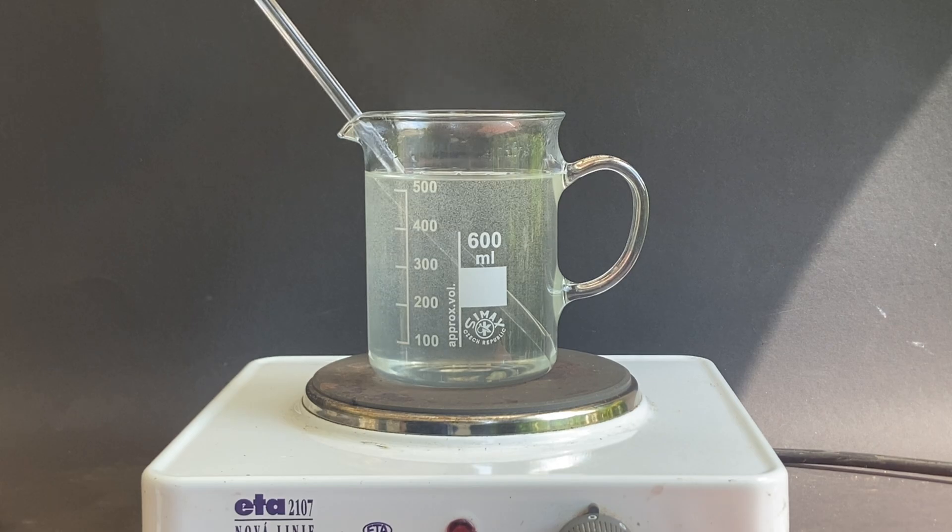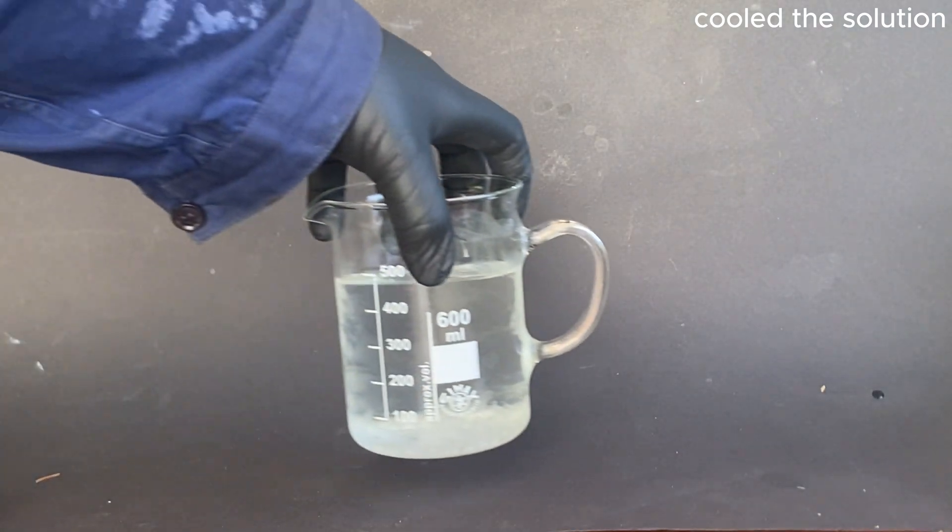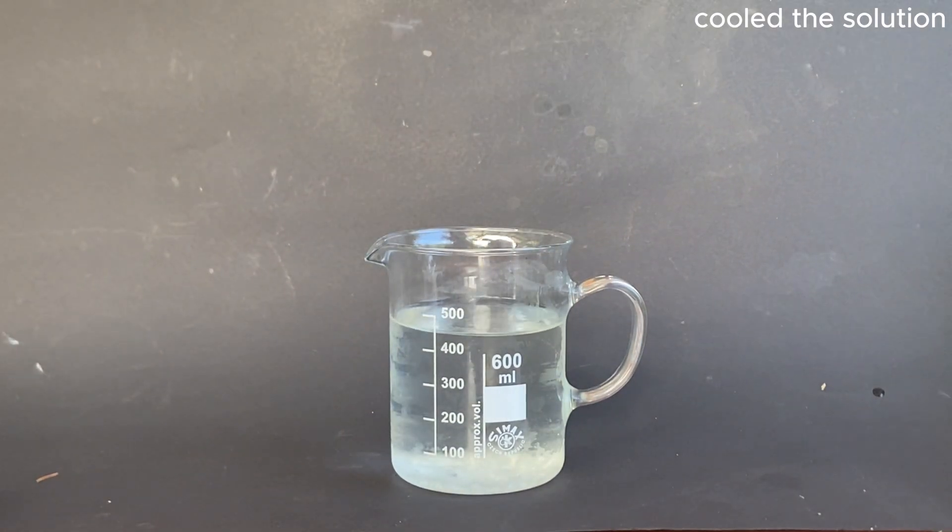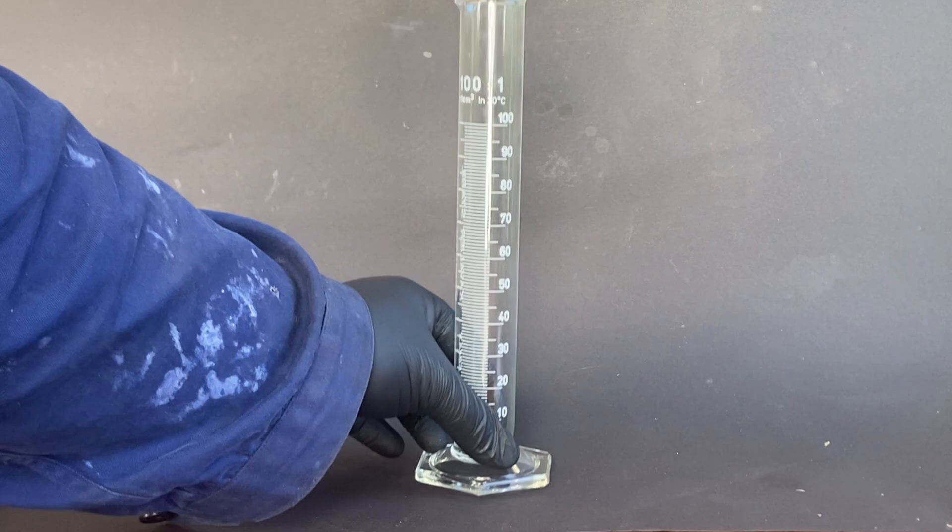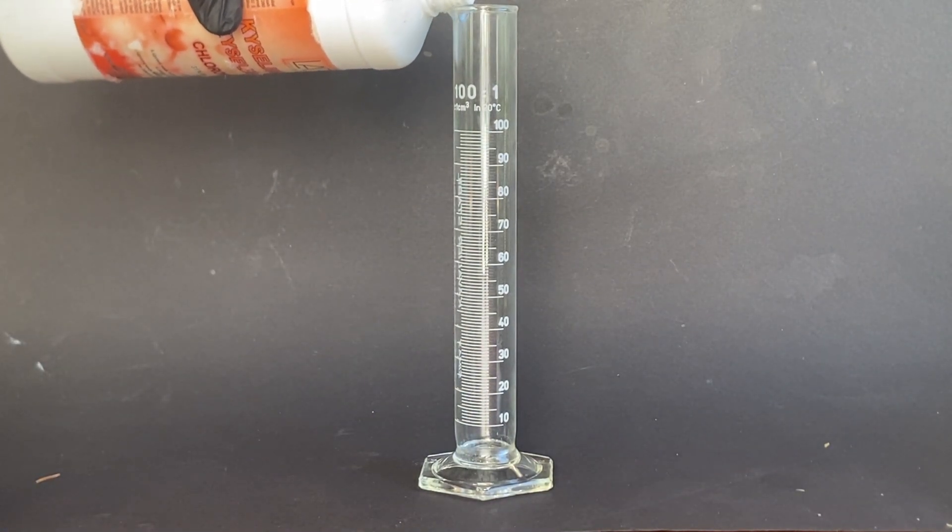in theory, if we cool the solution, the boric acid should crystallize out. However, after cooling, there were just a few small crystals present. So I did the math and found out that I need to add another 25 ml of hydrochloric acid.